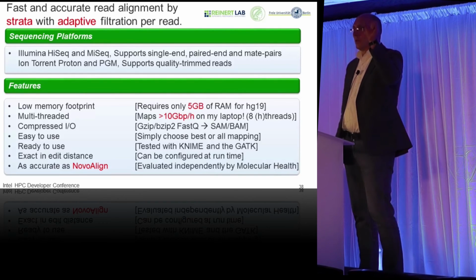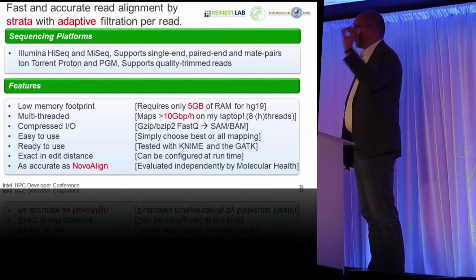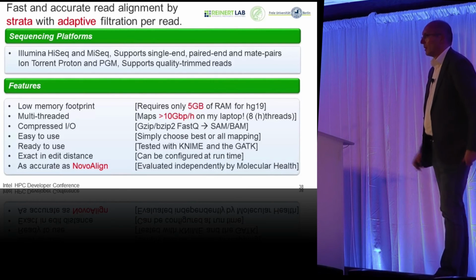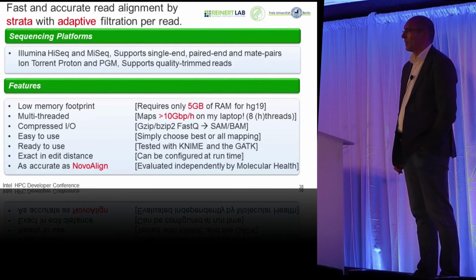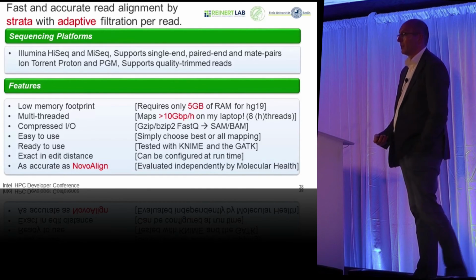These are basically, the first cell means these are all the reads with 0 errors. How many of those did you find? And then come all the reads with 1 error, with 2 errors, with 3, 4, and 5 errors. So what you see is that YARA and GEM, which has a very similar algorithm, are quite accurate. And at the moment, leading software, Bowtie 2 and BWA, are actually not. So they're not finding all the positions even with 0 errors because they have heuristic algorithms in them.